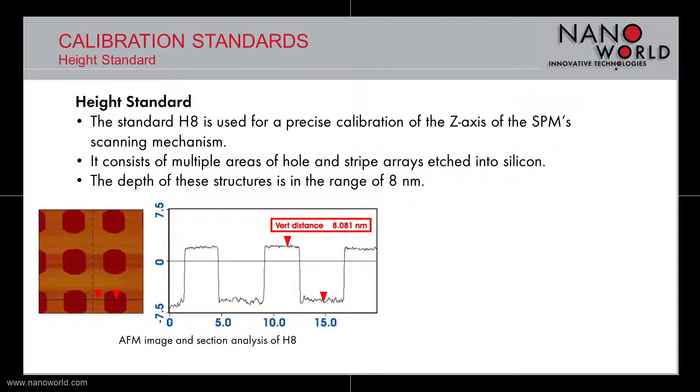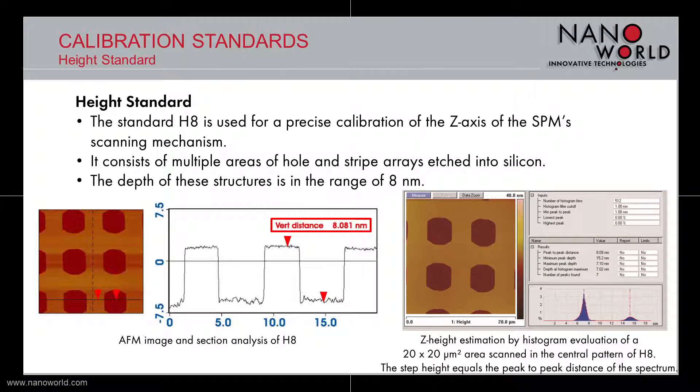On bottom right you can observe a Z-height estimation by histogram evaluation of a 20x20 μm² scan in the central pattern of the H8 standard. The step height equals the peak-to-peak distance of the spectrum and its value is 8.09 nm.